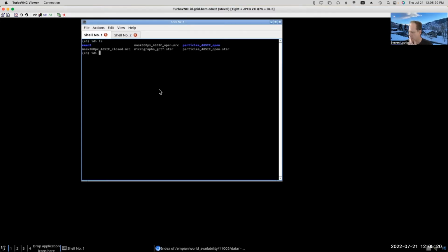I thought what we might do the next couple of weeks was delve into using the Gaussian mixture model stuff to look at particle variability, not just because of the Gaussian mixture model material, the program itself, but also because that was a good mechanism to force us to look at file formats and delve into how deep learning software might integrate with EMAN2.